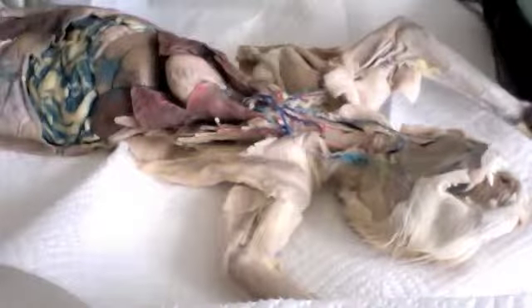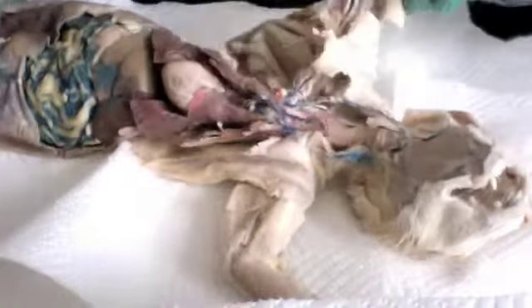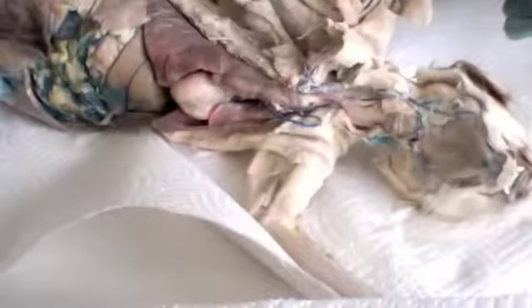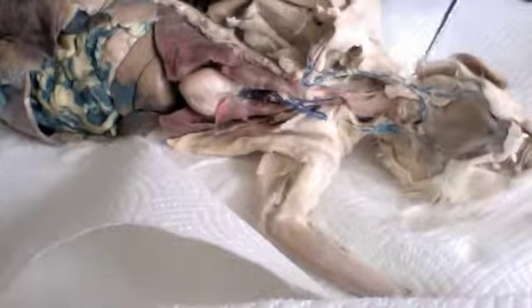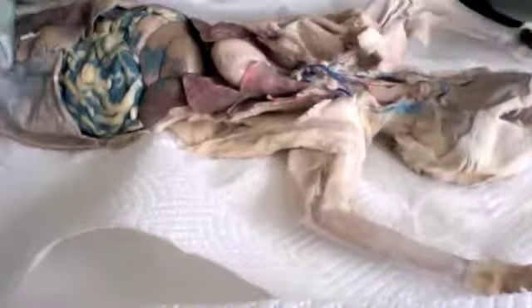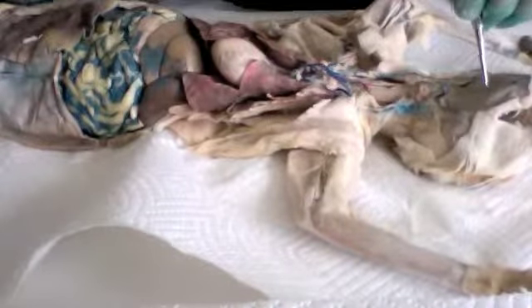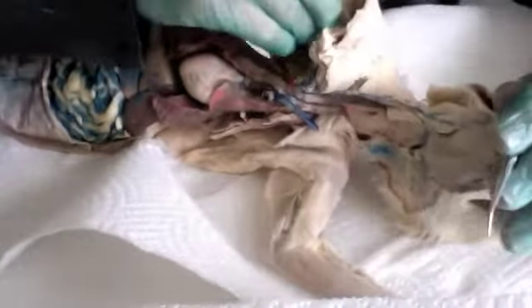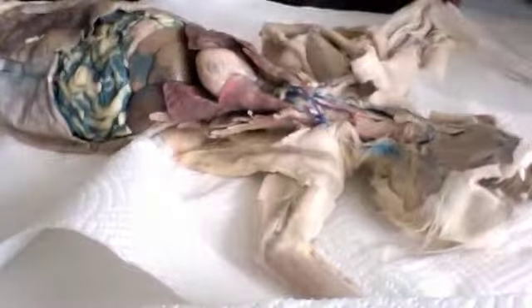And then we have the submandibular gland, which is located here. You can actually see it better here. It's located here. Right there. Submandibular gland. Then we have the sublingual gland, and the sublingual gland is located underneath the tongue. So it would be located right here, under the tongue of the cat.